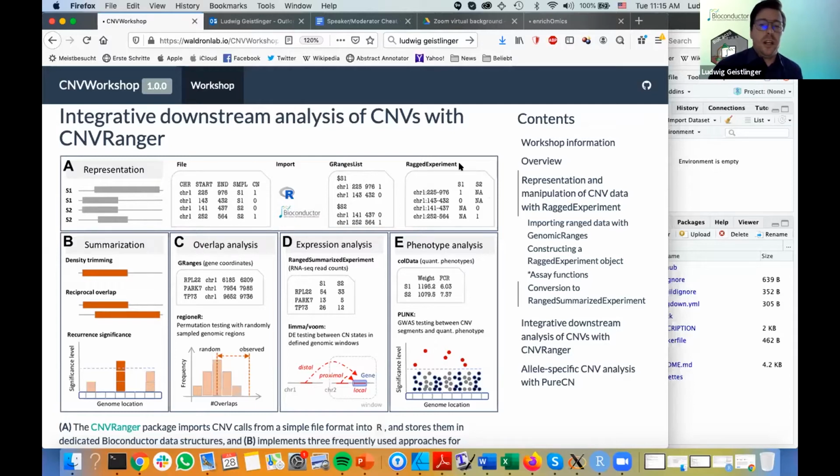And the other thing that Marcel introduced: if I would like to have a rectangular, matrix-like representation, for an access that is not a list-like access but rather a matrix-like access, then I would wrap a ragged experiment around it, where I then have this rows by columns representation.